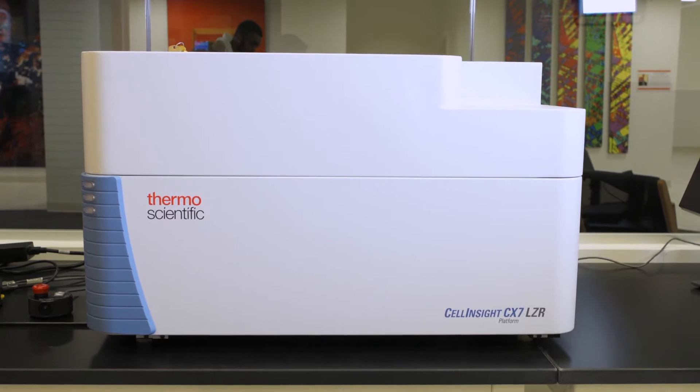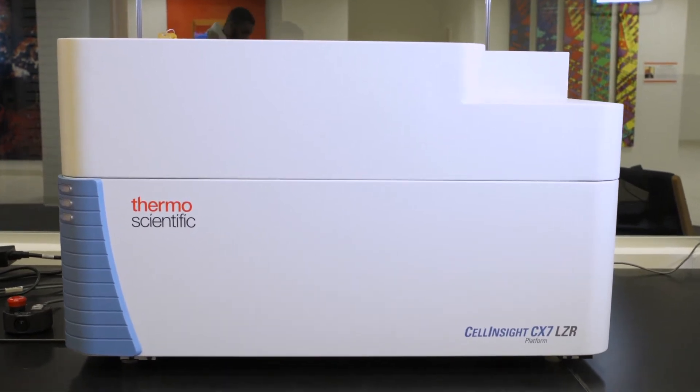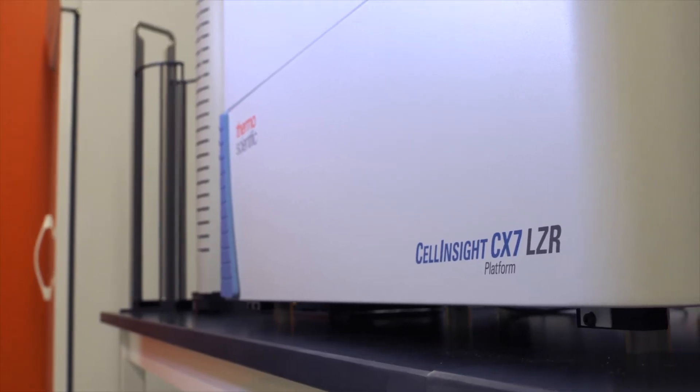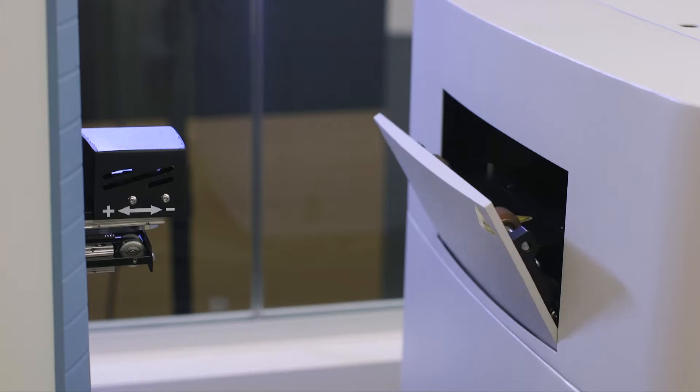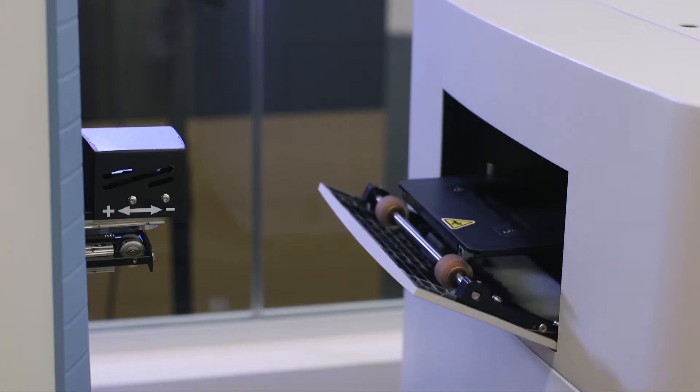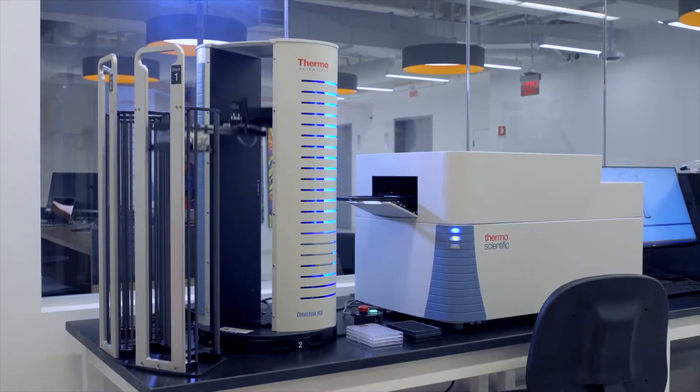What if there was a way to extract a lot of information from cells quickly, effortlessly, and in a turnkey fashion? Our Thermo Scientific Cell Insight High Content Analysis Instrument portfolio allows you to get one step closer to achieving this goal.